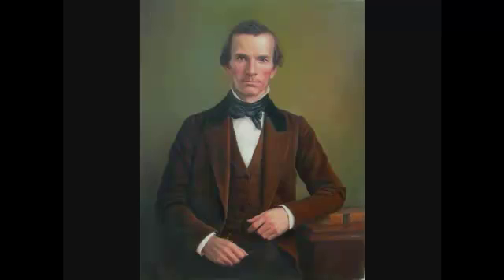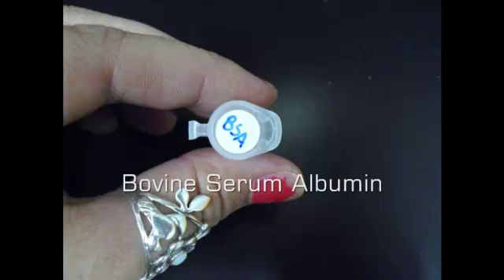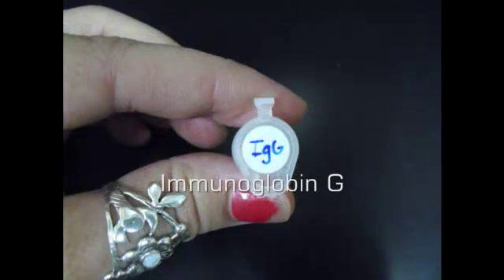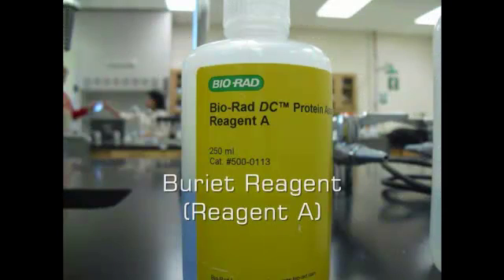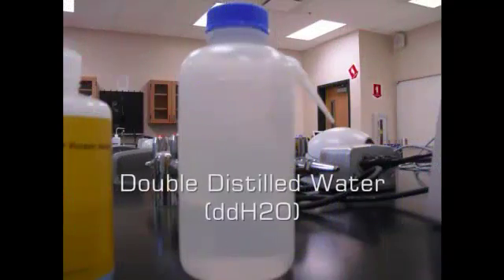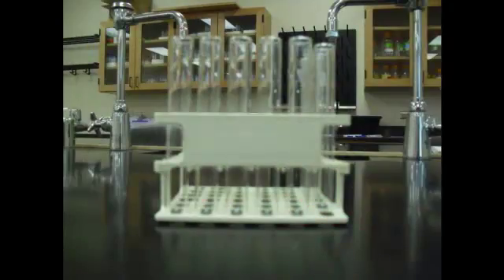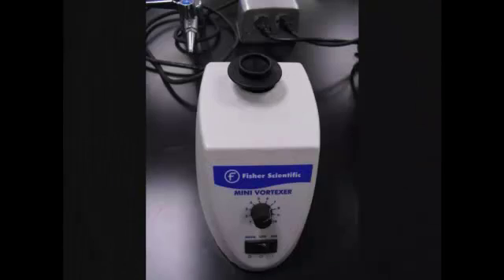I'll walk you through the Lowry assay first. Oliver Lowry, the biochemist — he's the one that developed the Lowry assay. In the Lowry assay, we'll be using bovine serum albumin (BSA), immunoglobulin G or IgG, the Biuret reagent or reagent A, Folin reagent or reagent B, and double distilled water. Some of the equipment used will be micropipettes, a 10 to 25 milliliter pipette, test tubes, cuvettes, as well as the vortex and the spectrophotometer.